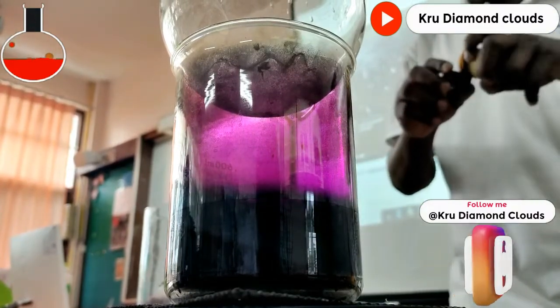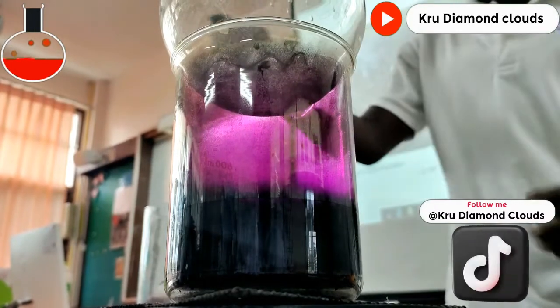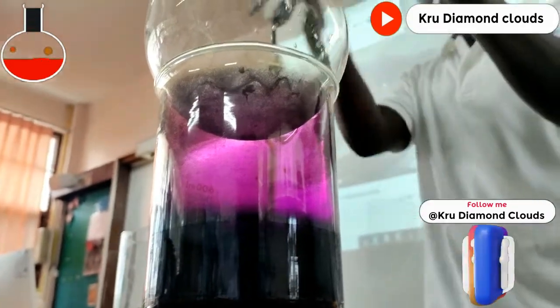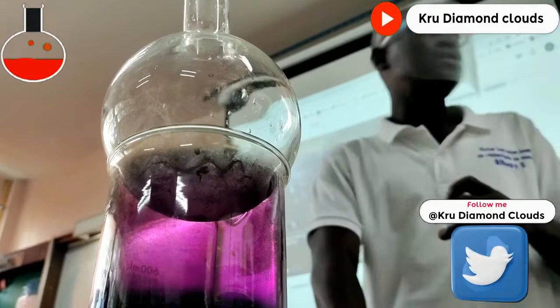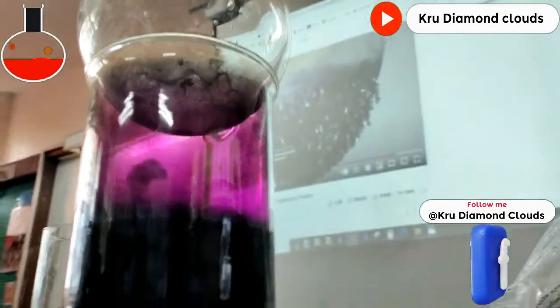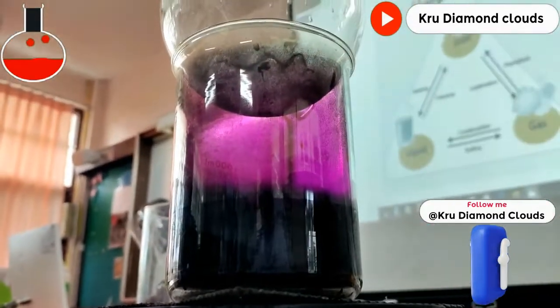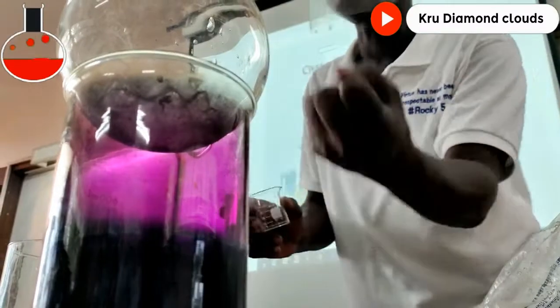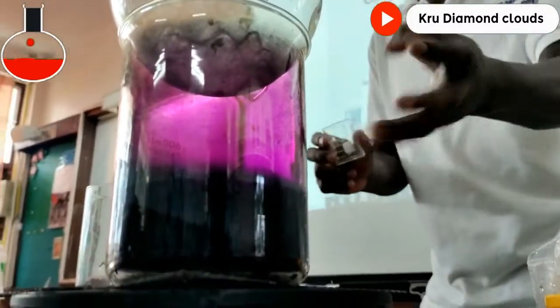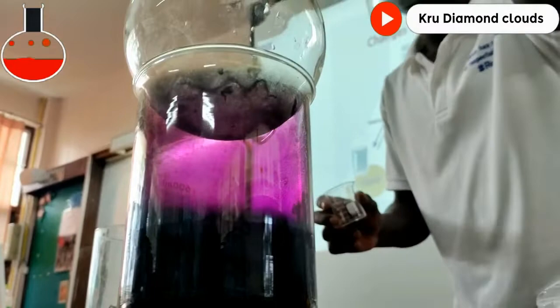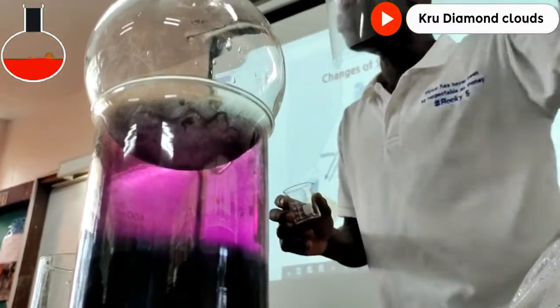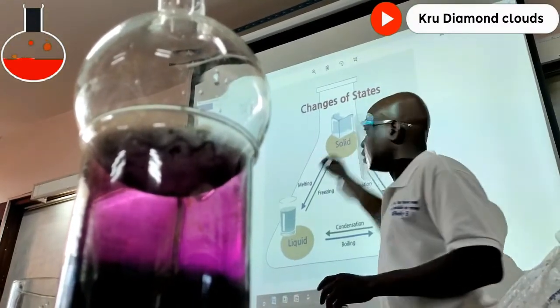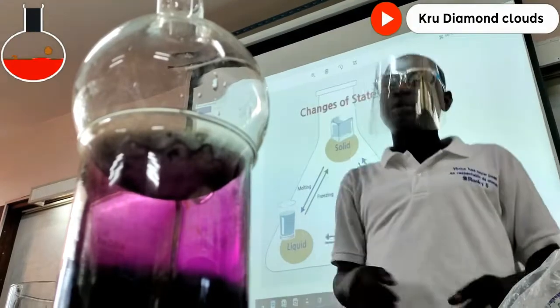Do you understand? This is solid. This solid here changes to gas. And solid changing to gas is called sublimation. Sublimation is solid to gas. And that is what you can see here — this is gas. And then the gas will cool down on the round bottom flask and turn into solid crystal, which is also called deposition. Deposition is gas to solid.